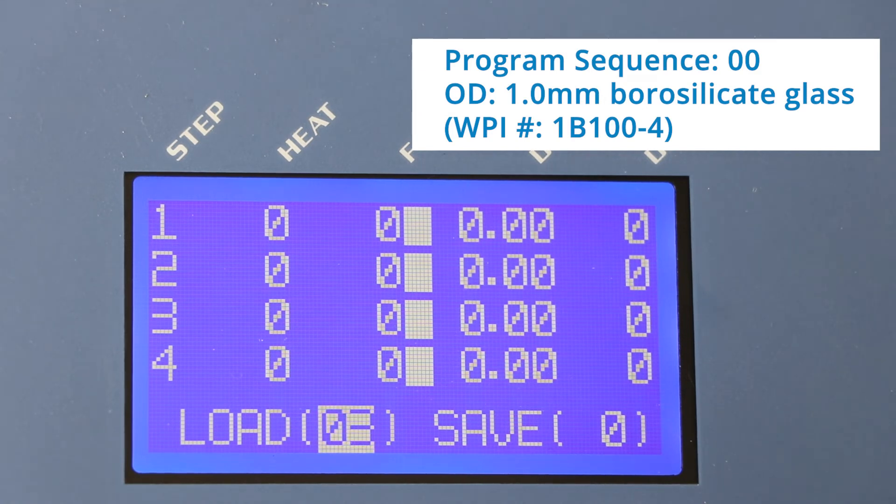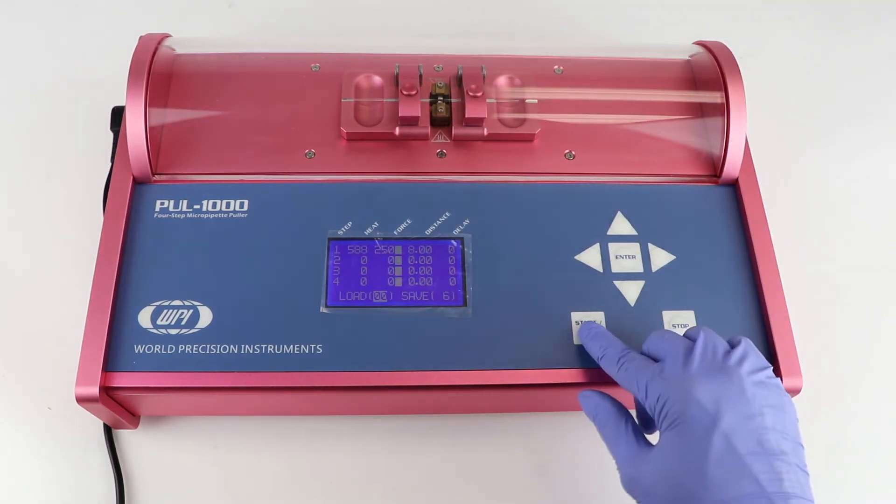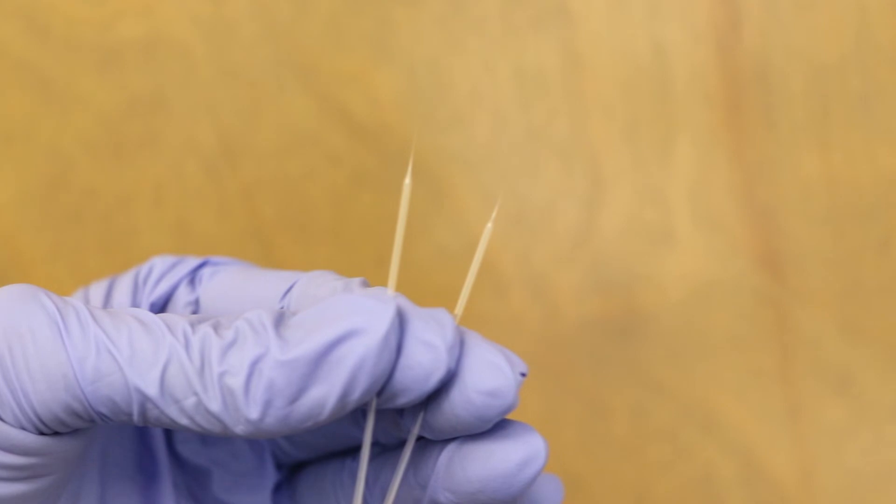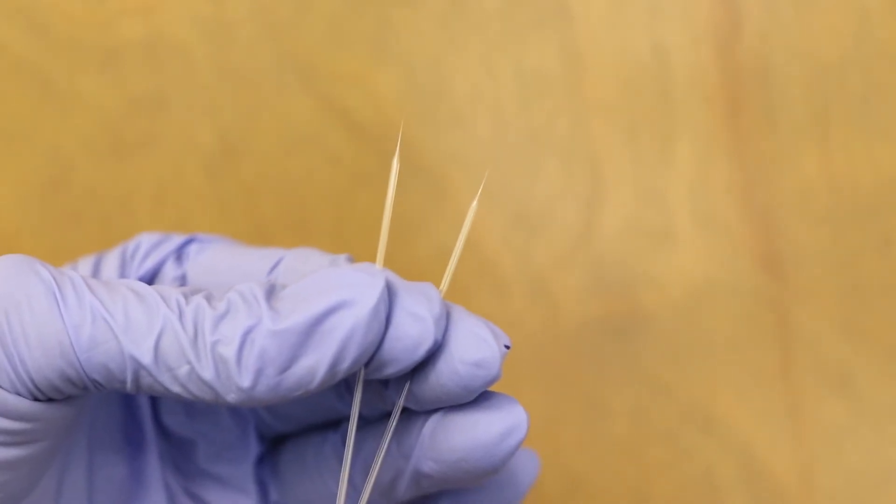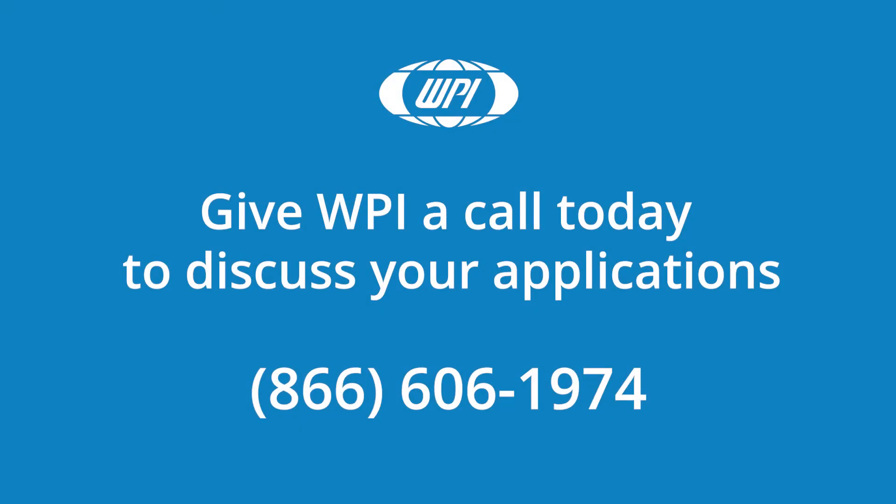Close the cover, press start, and the puller will do the rest. Each pull results in two identical micropipettes. Refer to the POOL 1000 cookbook for details about the factory-installed programs, and if you have any questions, just give us a call.